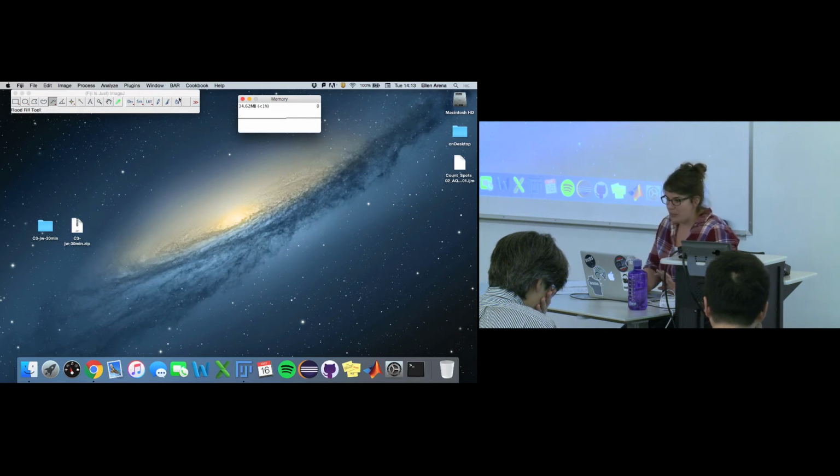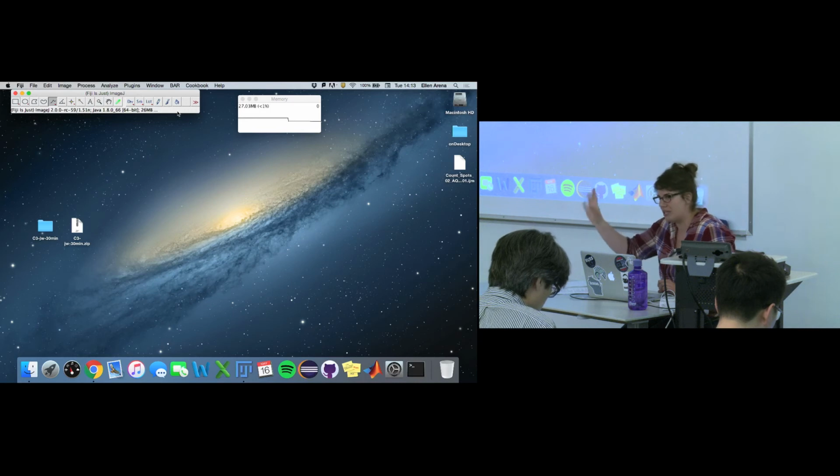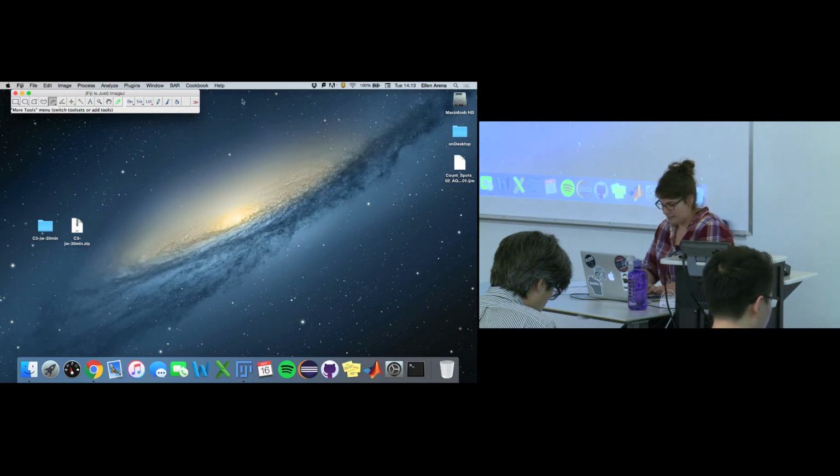Too, for example, if you click the status bar, this is just kind of an interesting thing to keep in mind. It does a little memory dump. So you'll see a little blip there in the memory. If you just click the status bar, it does a memory dump of everything you don't need, just kind of trashes it and clears the memory a bit. So, okay.